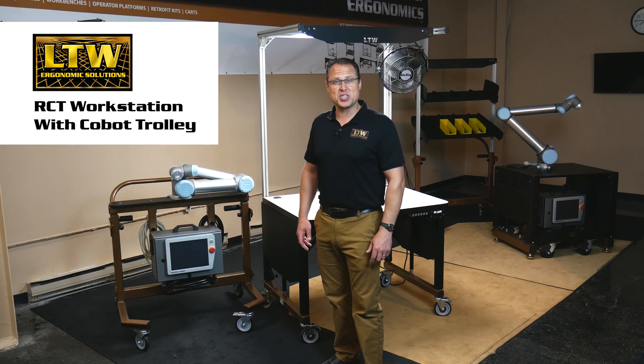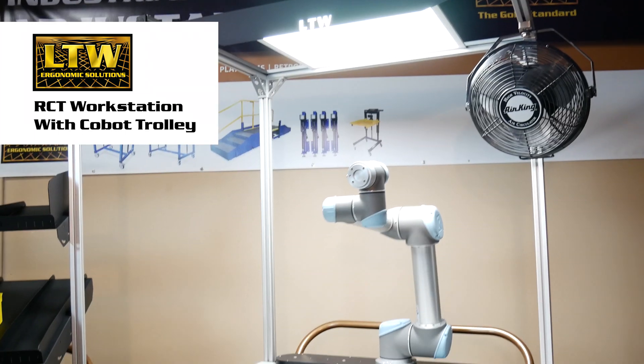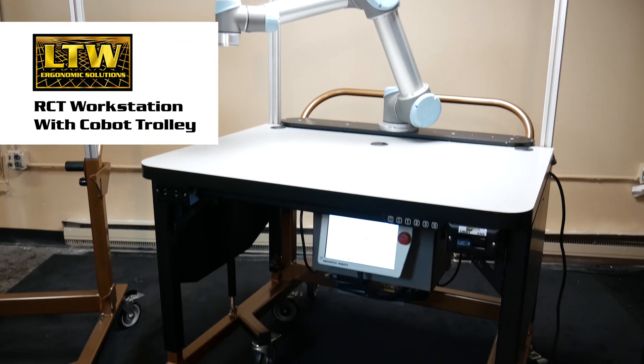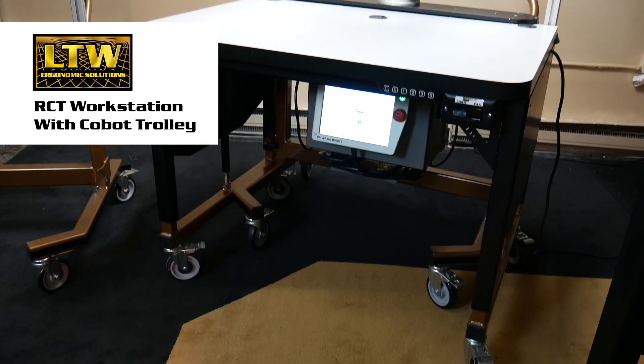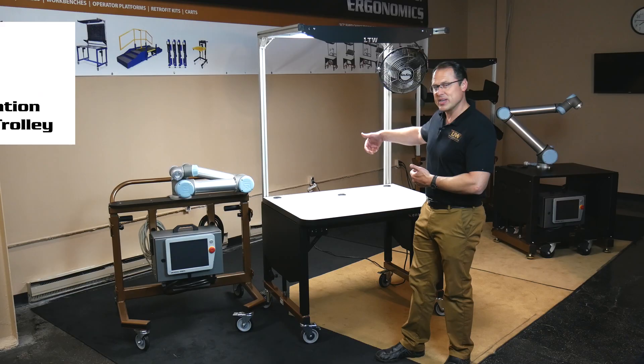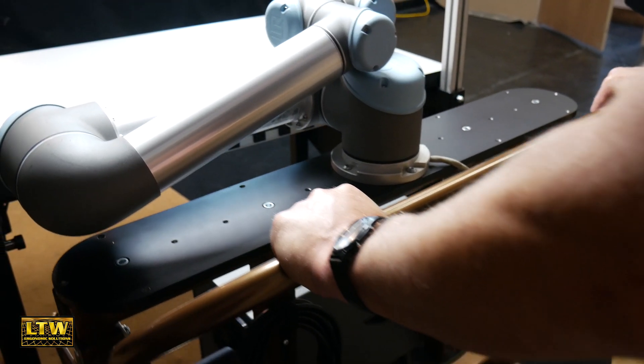Welcome to another LTW product showcase video. Today we're highlighting our RCT workstation — that stands for Rapid Change Technology — which incorporates a height-adjustable workstation. By pushing the electric button, a docking trolley docks right into the backside and goes up and down with it.